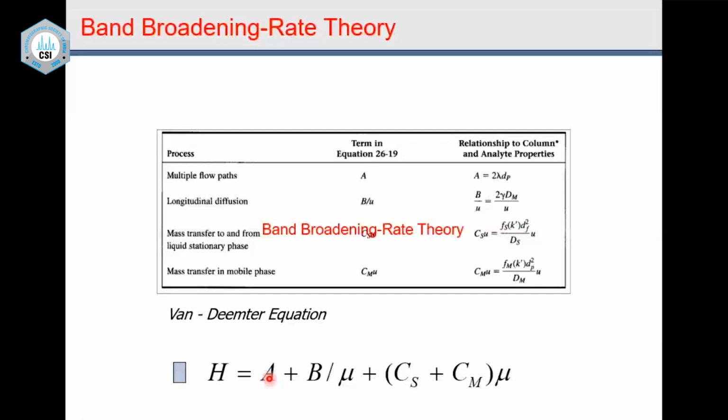And if I use a capillary column, when we go to the column part of my presentation, the capillary column is an open tubular column. That means the tube is open, there are no particles inside. The stationary phase is on the wall of the column, and the column is totally empty inside. So there will not be any eddy diffusion there, and no multiple flow paths are possible.